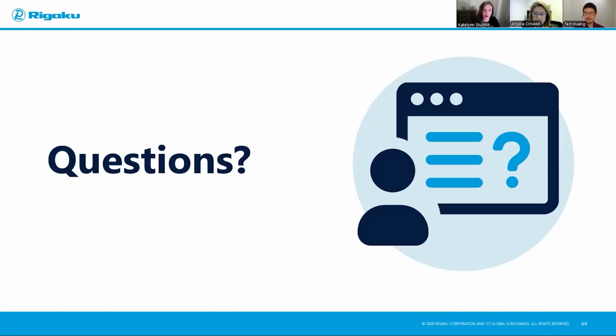Okay. So that's also a good question. I actually just talked about this with someone in our company not too long ago. So a couple of ways. You can already know, okay, I want to do this correlation. So you just scan it as is. You don't even touch your sample. You just scan it at a higher, smaller FOV, and then you put it in the data loader because you didn't change any dimensions. As long as you put in the right size, it'll already be quite aligned.